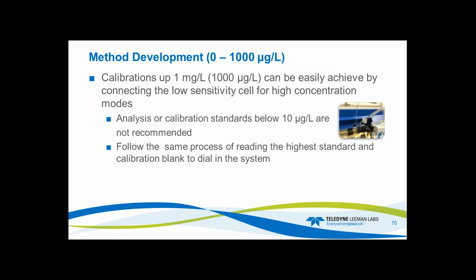So we can easily achieve that by connecting the low sensitivity cell for high concentration modes. So the analysis or calibration of below 10 ppb is not recommended in this method. So you want to follow the same process of reading the highest standard in the calibration blank.